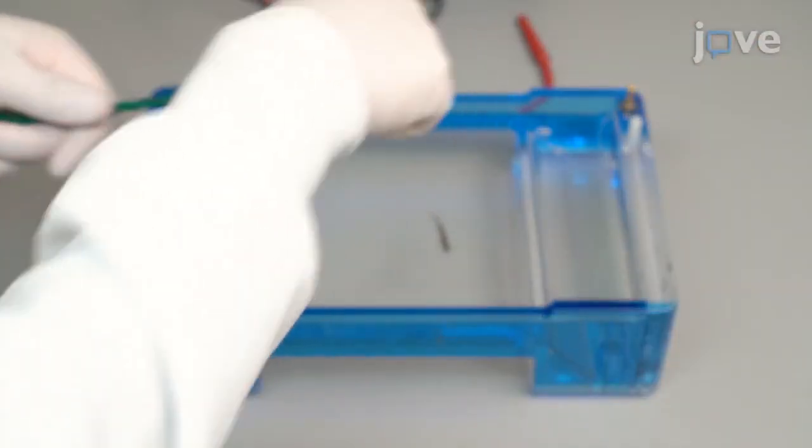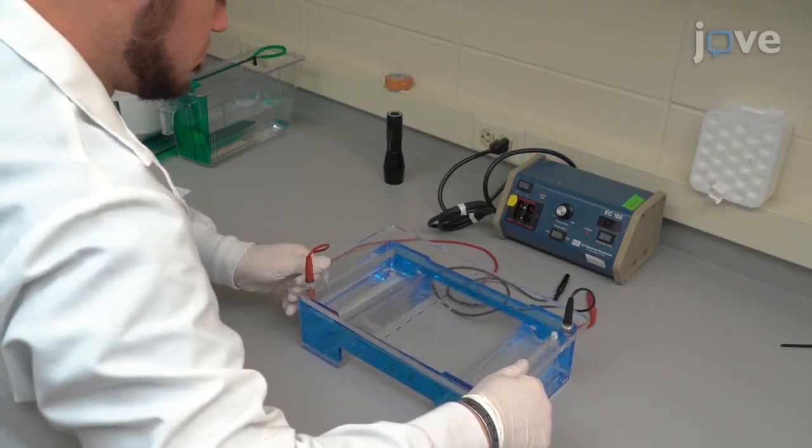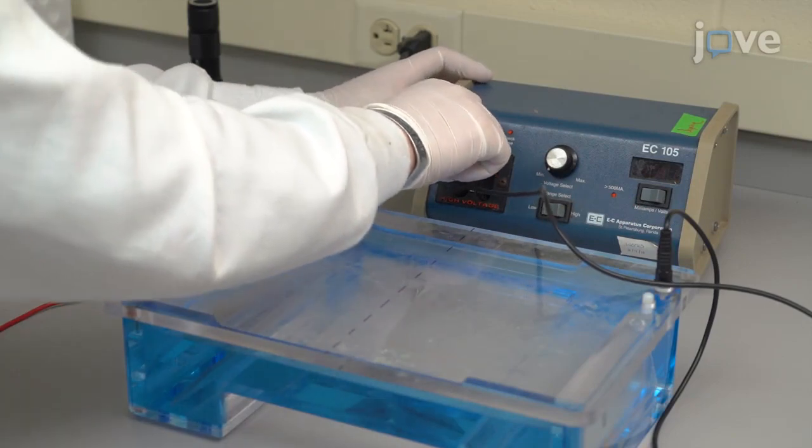Next, in the dark room, place one fish in the center of the Shuttlebox. Secure the lid and attach the electrodes to a power supply.